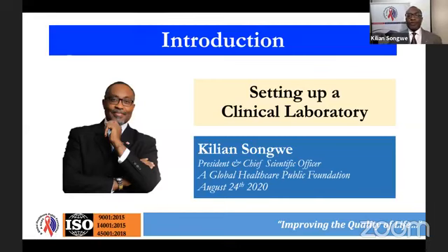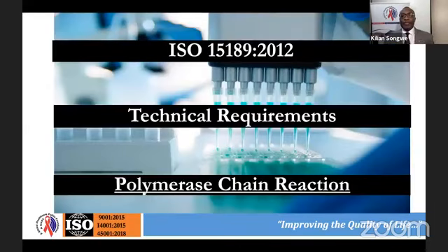there are a few things that we're going to look at here today. Again, as I said, we're looking at the International Organization for Standardization, standard 15189, which deals with laboratory medicine. I'm going to take you through a few key requirements on the technical side, specifically personnel, the environment in which the work needs to be done in, and then issues around the quality of testing. So Denis will take us through the PCR reaction.